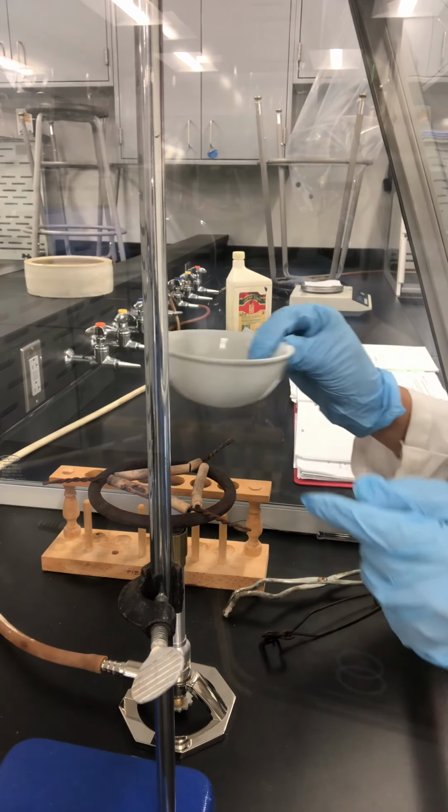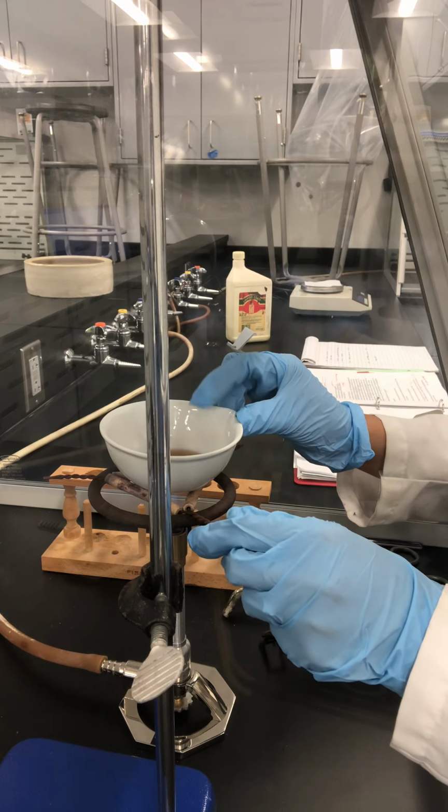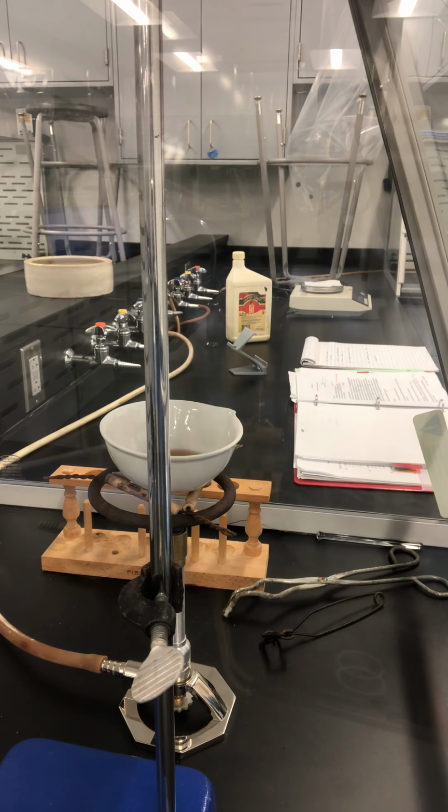Okay, so what we need to do now is put this over the flame and heat it up until it can ignite by itself.